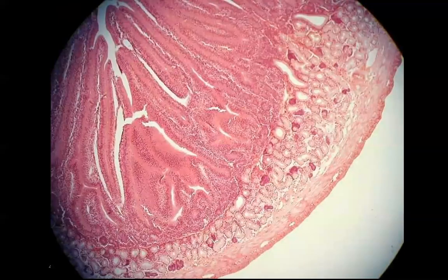So when you look at the duodenum under the microscope, what you'll see is this is the mucosal layer. And then this is the submucosa. And all of these gland-looking structures are the duodenal glands, or the Brunner's glands, that are secreting that alkaline fluid. Then there's the muscularis externa that's external to that. So you're looking in the submucosa to see if there's anything interesting going on. Here it's glands, so you know you're in the duodenum.